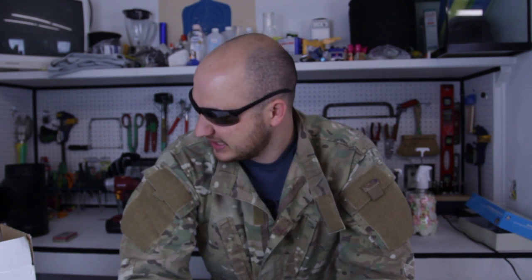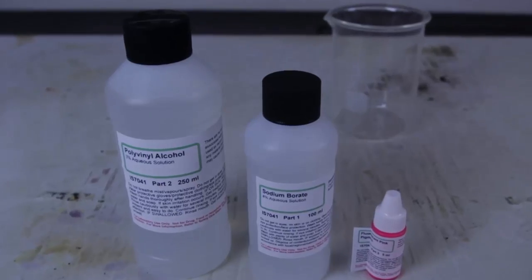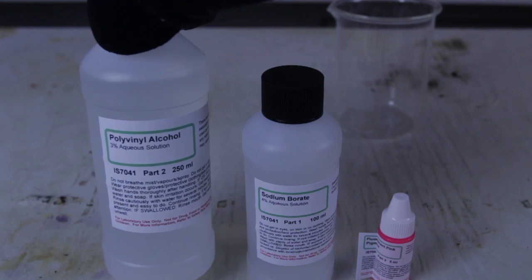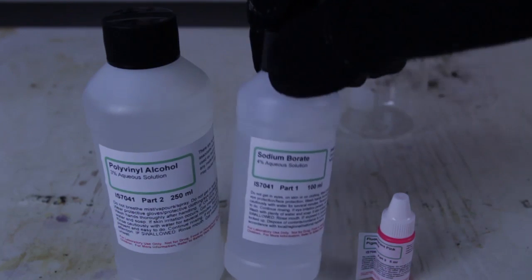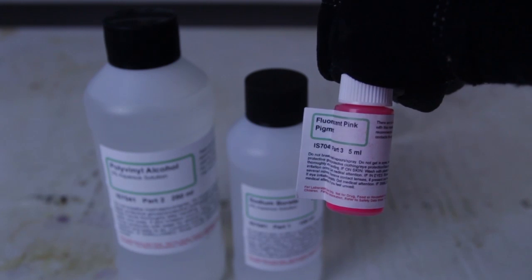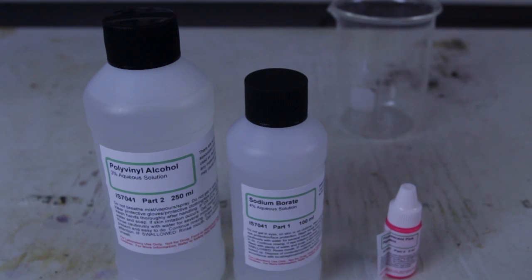Welcome back to my laboratory where safety is number one priority. Today we're going to be doing fluorescent slime with polyvinyl alcohol. For this experiment we're going to need polyvinyl alcohol 3%, sodium borate, and fluorescent pink pigment. With these chemicals I'm gonna make fluorescent slime.